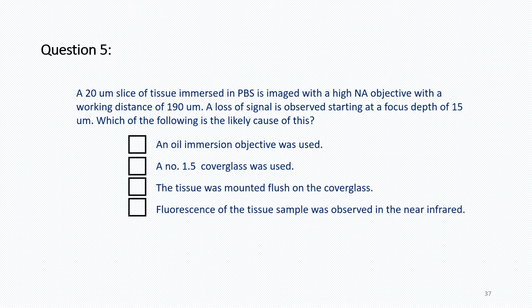An oil immersion objective was used. A number 1.5 cover glass was used. The tissue was mounted flush on the cover glass. Fluorescence of the tissue sample was observed in the near infrared.